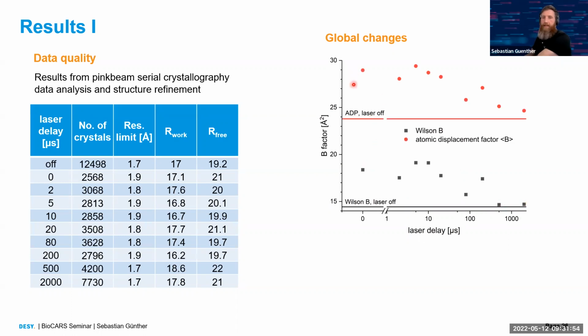We then look at the refined B factors from the structures. We actually see a similar effect, that we have an immediate increase in the overall B factors, which are then cooling down to baseline.